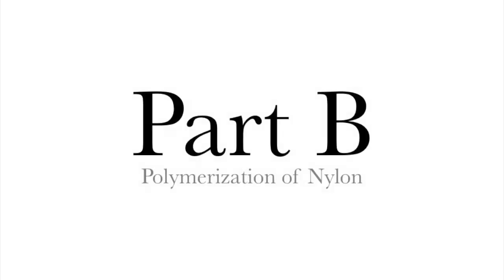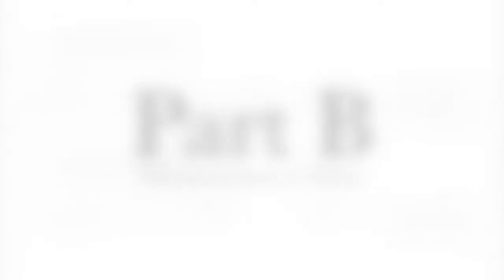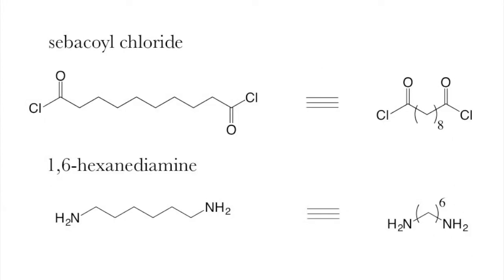Part B will be the synthesis of nylon. This is the same kind of nylon we use for stockings and for rope and a variety of other products. For this we have two chemicals we'll be using. Sebacoyl chloride, which has 10 carbons on it, and these highly electrophilic acyl groups.